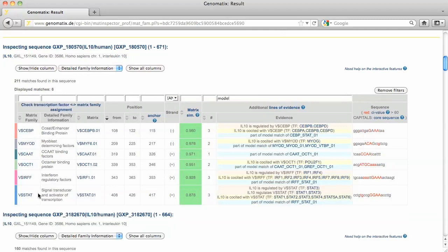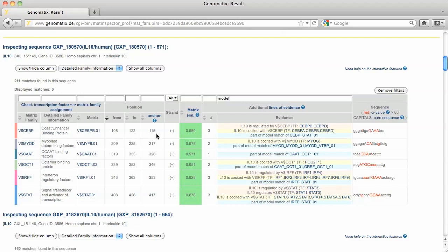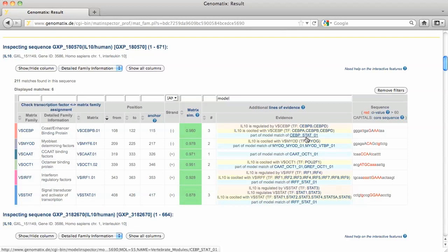The binding site matches are also part of a model match. In some cases, only one element of the model is displayed by MATInspector. For example, the CEBP site at position 115, which is part of a CEBP-STAT model. The corresponding STAT site is not shown.